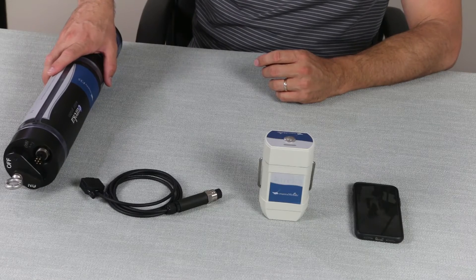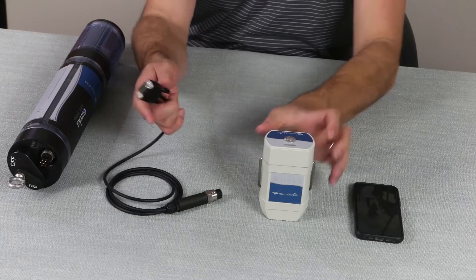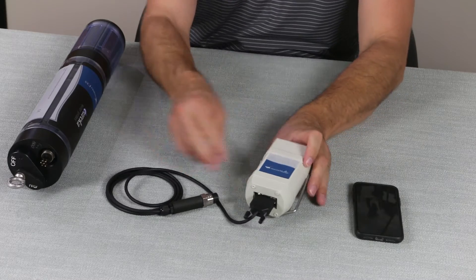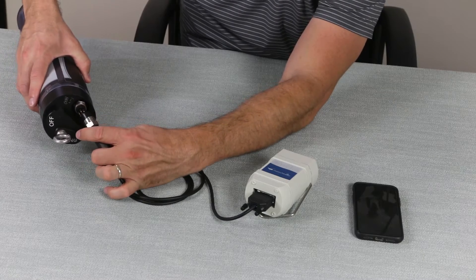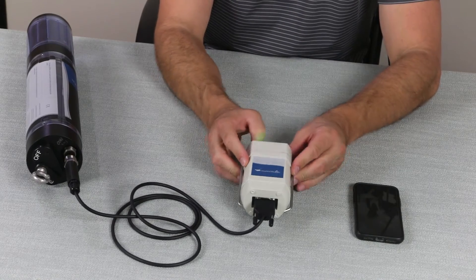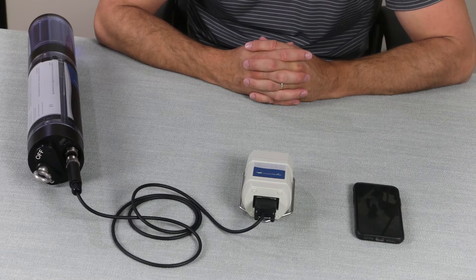Now that we have your probe all cleaned up, we're going to connect it to our Manta Mobile Bluetooth device. We'll connect our 9-pin end of our cable to the Manta Mobile and our 6-pin to the MultiProbe. Press the power button on the Manta Mobile Bluetooth device. Then we'll tap the icon on our phone or tablet to start the Manta Link program.